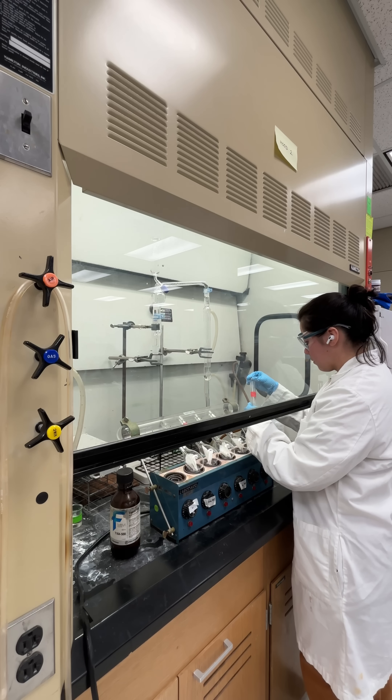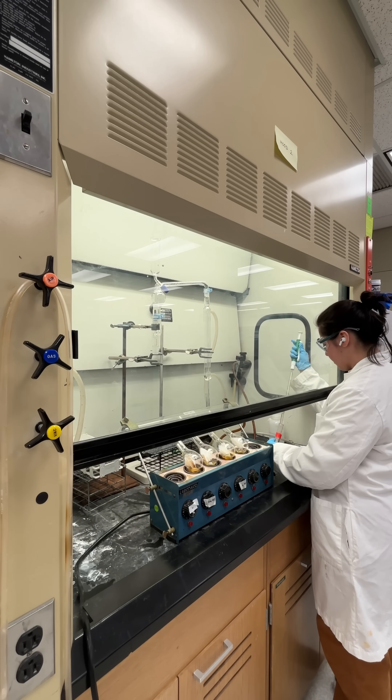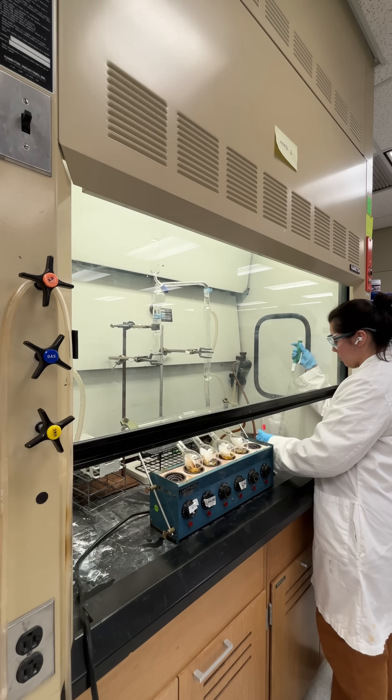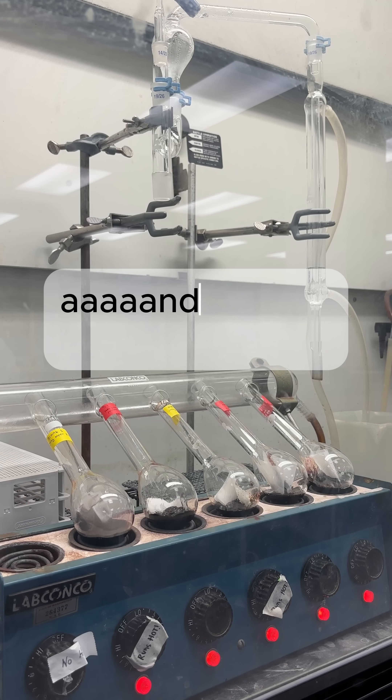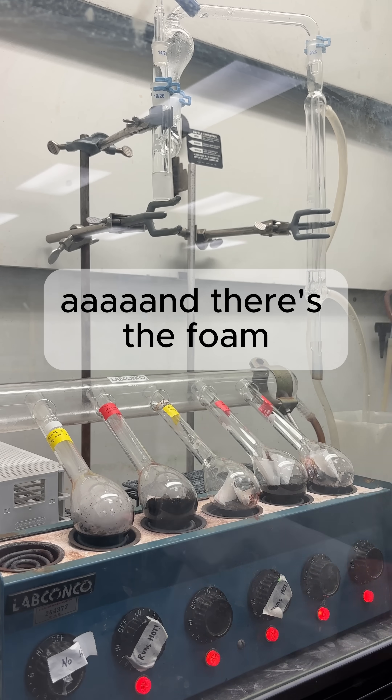Like I said, I'm doing a Kjeldahl method. This method is to determine the amount of protein in a food product. Here I am adding sulfuric acid to start the digestion process, and here's the foaming that happened because the Tween didn't work.